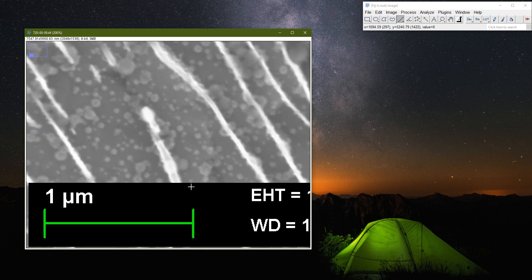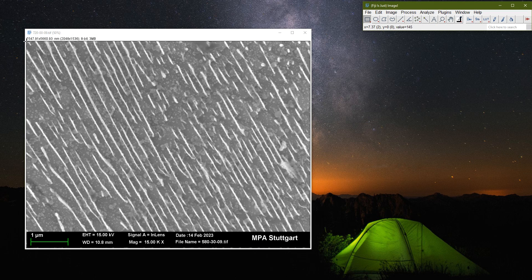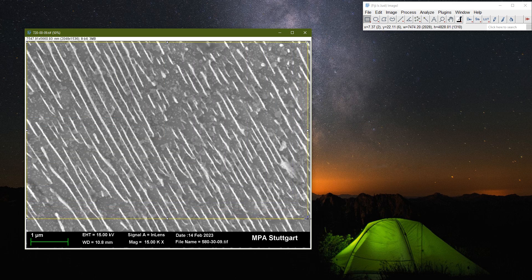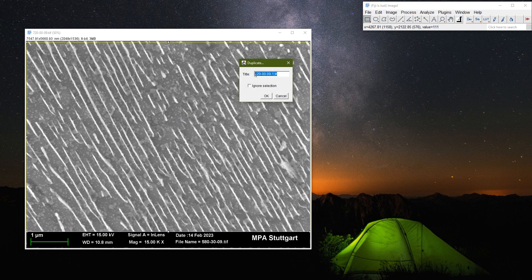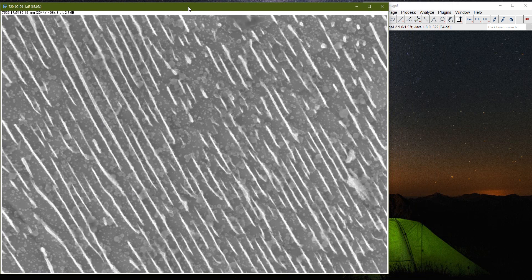I will click to remove the line, then press Shift and scroll back to the original size. Now the scale of the image is set. I want to capture just the middle area and get rid of the lower belt where all the scale information is written. I will select a box from here to here, then right-click and choose Duplicate. I'll give it a title and click to make it bigger.